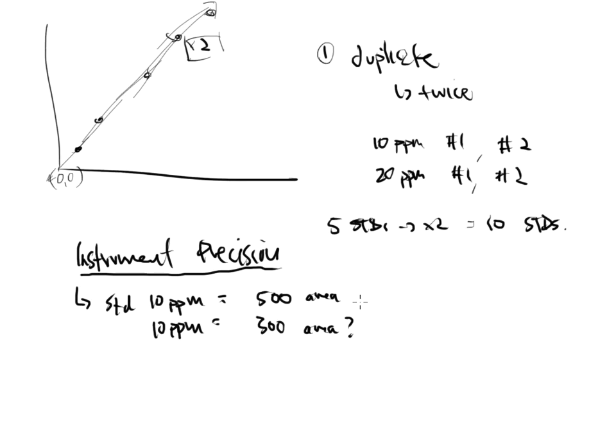Now, there could be duplicates of everything, right? There could be duplicates of what we call the standards, and that's why we do them. We want to test the machine and the reliability of the instrument. That's what we're after. We also can have duplicates of samples. So we'll randomly pull a couple of the samples and we'll do duplicates of those just to do a quick check, a random spot check to make sure the instrument probably is functioning the right way.